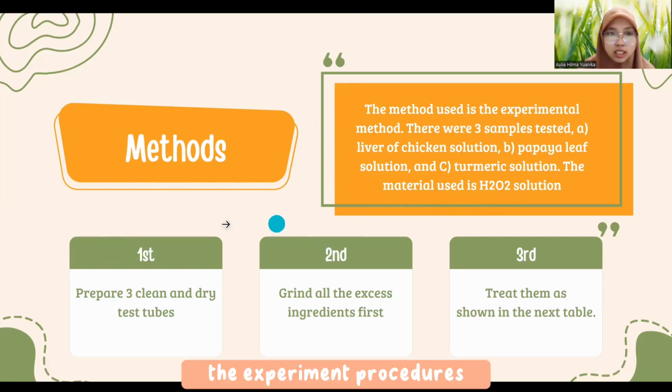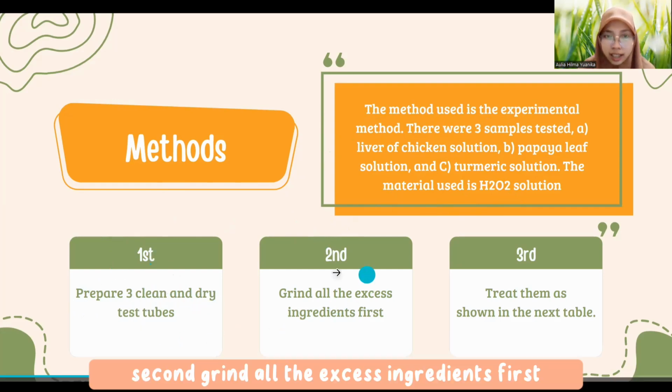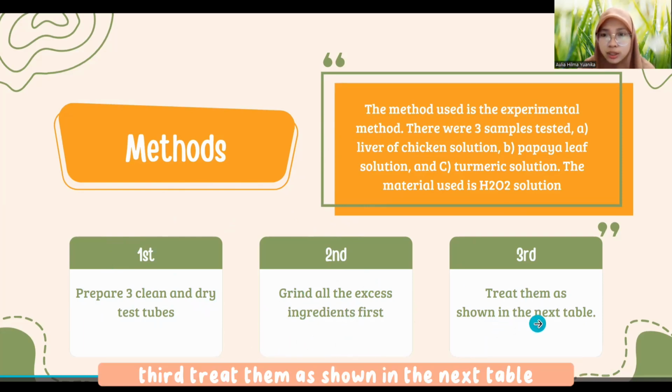The experiment procedures. First, prepare 3 clean and dry test tubes. Second, grind all the ingredients first. Third, treat them as shown in the next table.